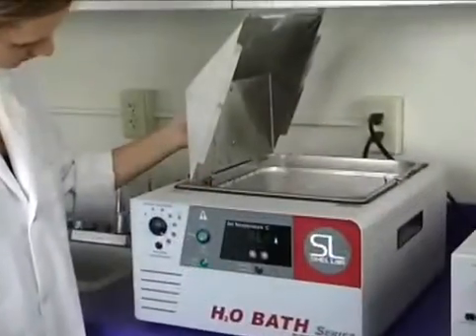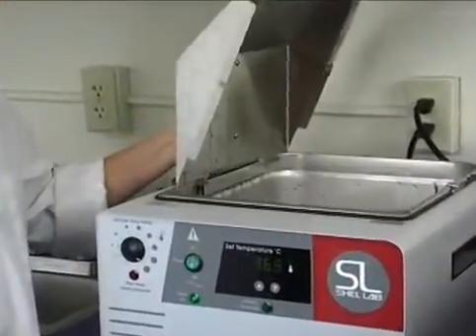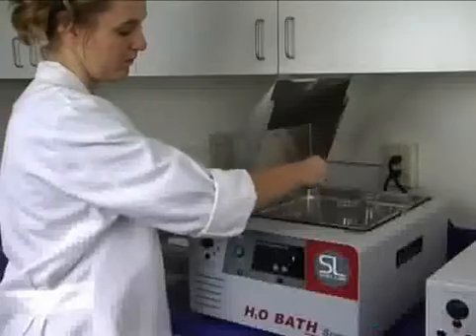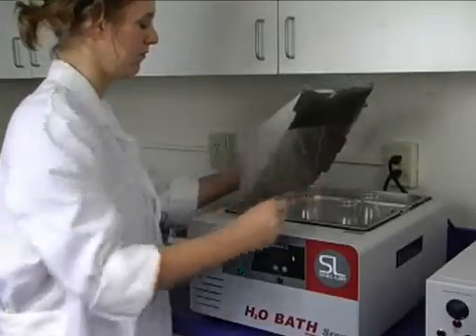Each unit features a lid holder that allows condensation to flow directly into the tank rather than spilling onto the lab bench. The stainless steel lid also accommodates a variety of flask sizes.